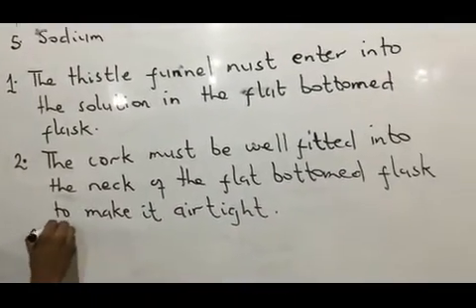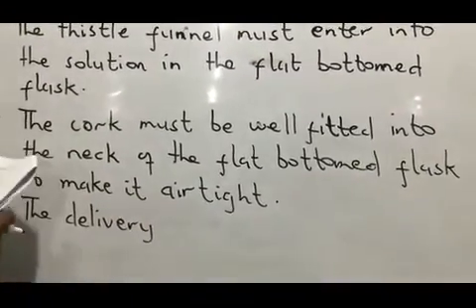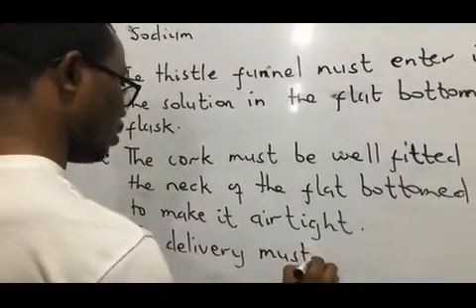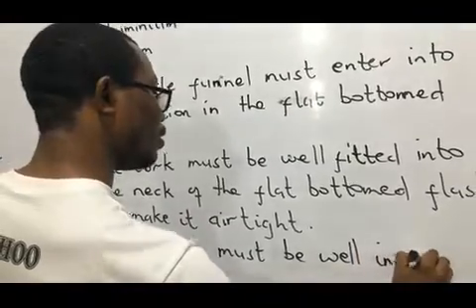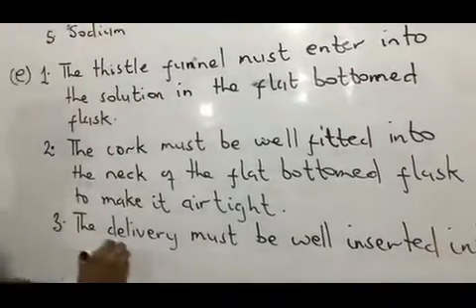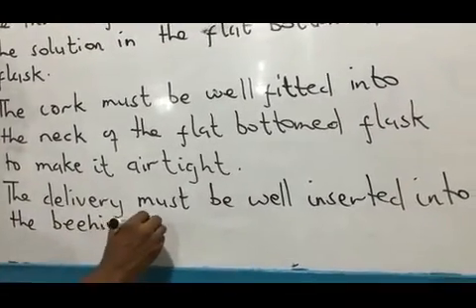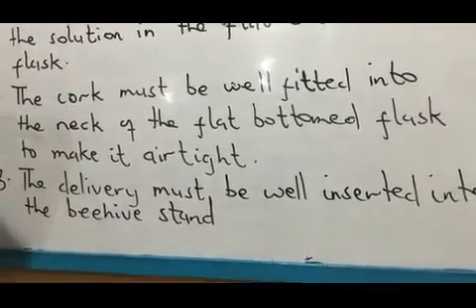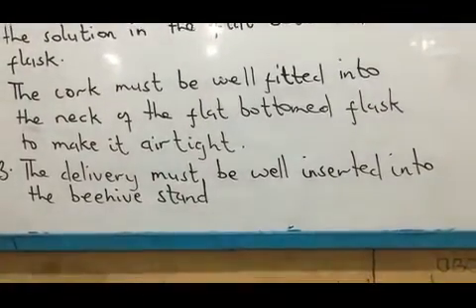3. The delivery tube must be well inserted into the beehive stand. And you can also add that the delivery tube must not enter into the solution in the bottom flask.